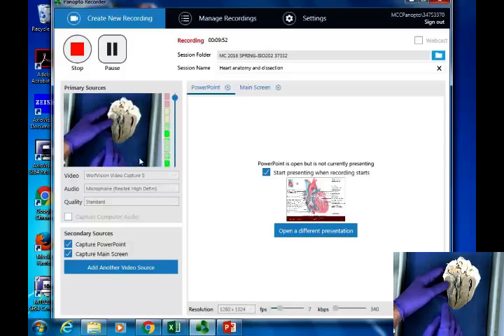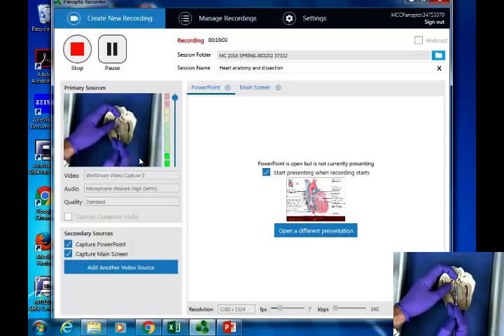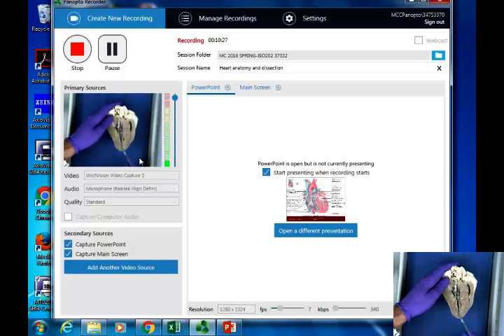So V-shaped pattern comes in this way, goes up through this way, and notice it's going to pass through along here. This, what I'm picking up right here, there's a little membrane, or what looks like a membrane right through here. Okay? This right here is the aortic valve. So when we're exiting that left ventricle, it's going to pass through the aortic valve. It's going to go up into the aorta, and then that's going to curve around and go out to the body. So remember that our semilunar valves don't have any chordae tendineae attached to them. Only the atrioventricular valves, like you see there. So this flap right here and right here, these are going to be parts of the aortic valve, and this is going to be the aorta up there.